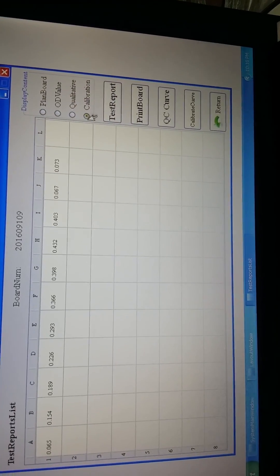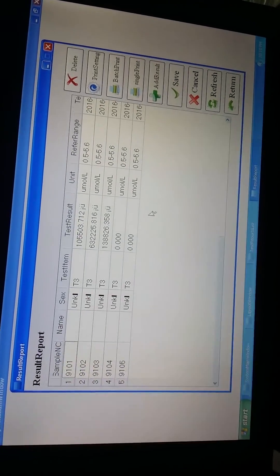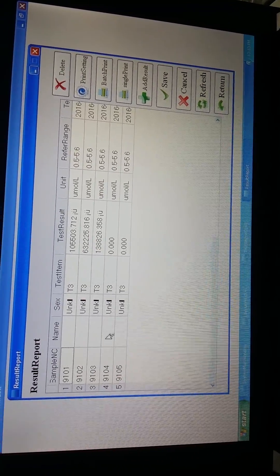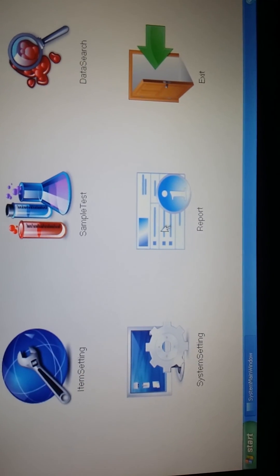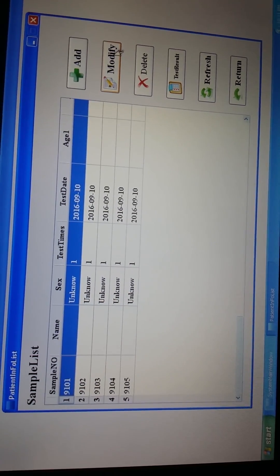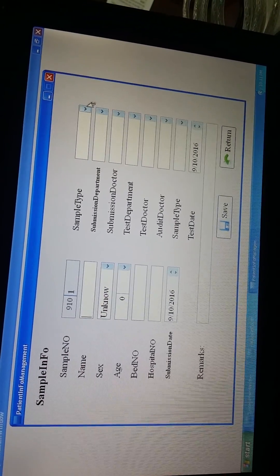Now we have the results. Press the calibration button to get the calibration curve, then press test reports to view the results. If we want to add the patient's name, age, sex, or the hospital name, we go back to the interface, press Report, choose the record, and press Modify. From here you can enter the patient name, sex, age, bed number, and hospital, and from the left corner you can choose the sample type.